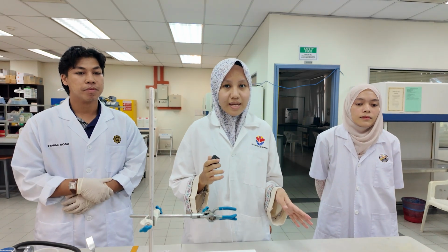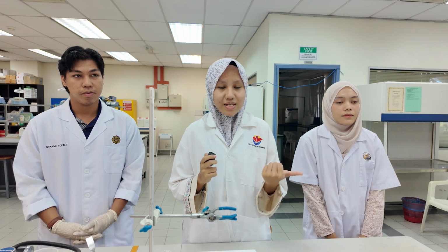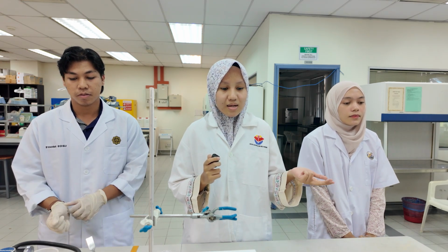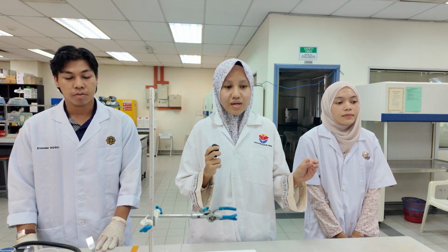Okay, so now we are moving to the problem statement. In this experiment, there are 3 problem statements. The first one is solvent selection. The second one is the cooling process, and the last one is product loss. First and foremost, it is very important to choose the suitable solvent, for example, methanol.